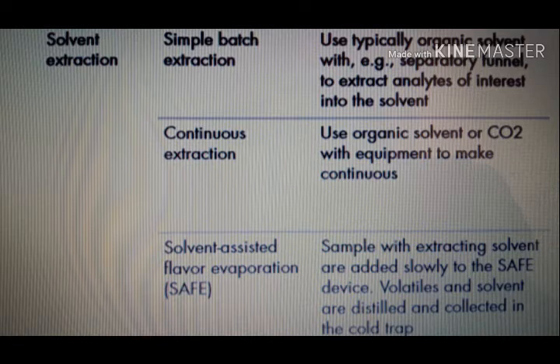Next is solvent extraction. There are three specific methods. First, simple batch extraction. Second, continuous extraction. And lastly, solvent assisted flavor evaporation, or we call it SAFE.